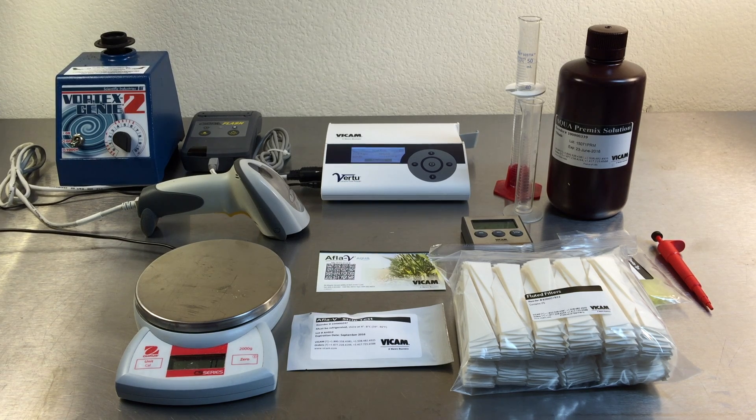Disposable supplies include the Afla-V Aqua strips, Afla-V Aqua pre-mixed extraction solution, filters, extraction tubes, and pipette tips.